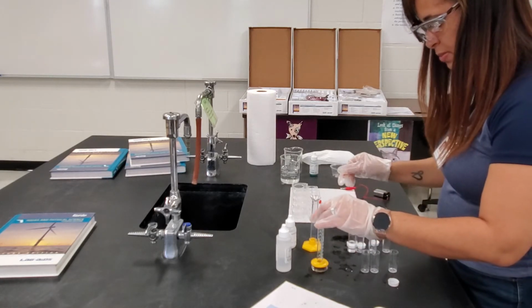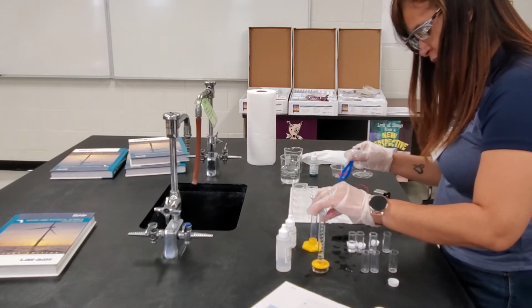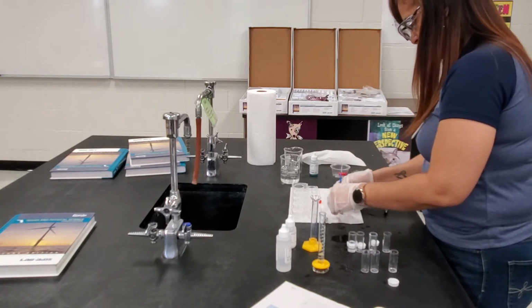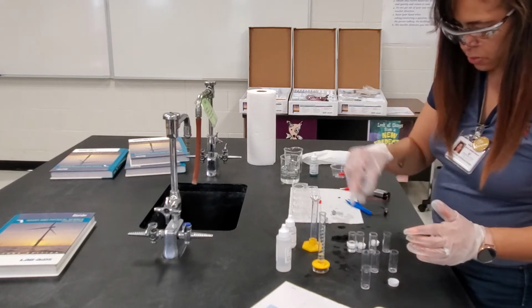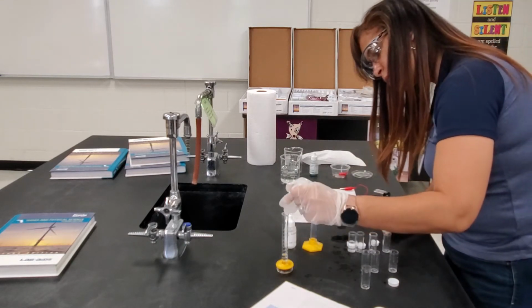So what I'm going to do is pour the ethanol in here so that I can make sure I have a full 5 milliliters, because we did lose some ethanol that sank like a stone. And we'll take our sample out. So I've got to get us back to 5 milliliters.